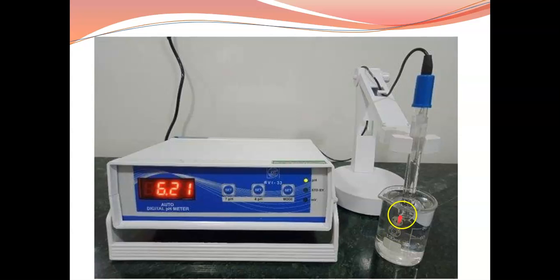So this glass electrode is used for measuring the pH of the solution in pH metric titration. So this pH meter is actually going to show the values of the pH when we are going to perform the titration. So in titration, we are going to add some titrant from the burette into this analyte, and then we are going to note down the value changes. So this is the use of the glass electrode. It is used to measure the concentration of analyte in which H plus ions are present.